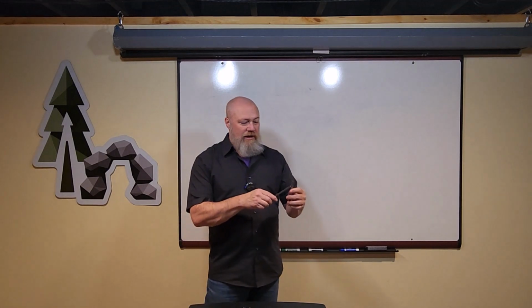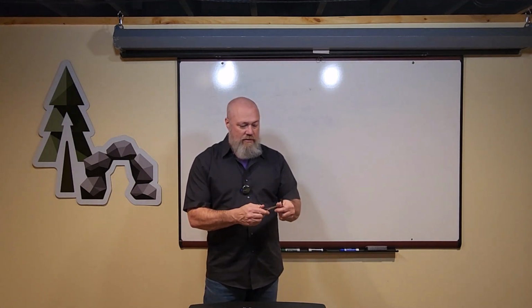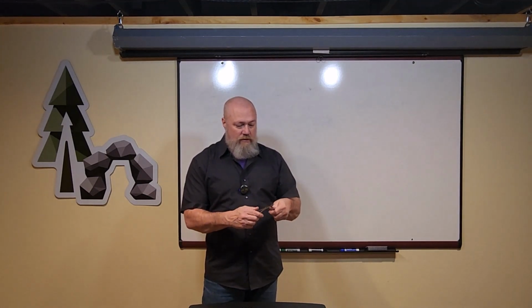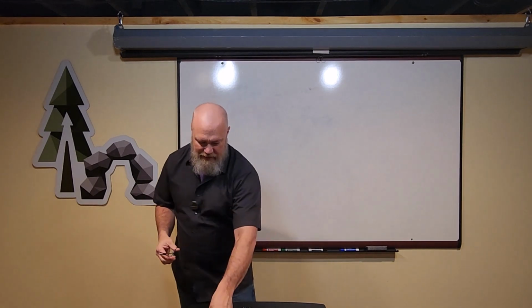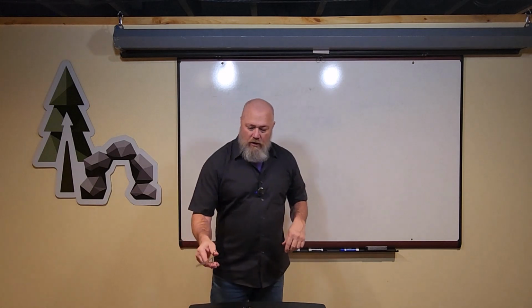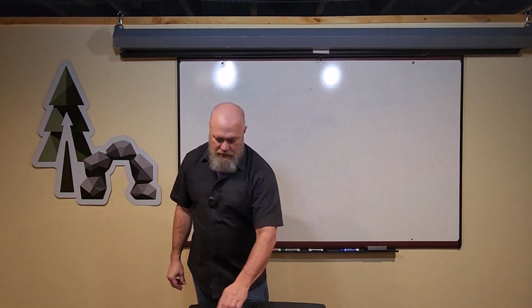Let's see if we can hear that. There we go. Okay, and then I have my scalpel handle. Remove the blade the same way. I'll lift that little tab up. All right, and then grip the blade and slide that off. Well, that's new and it's stuck on there, so we'll come back to that demo later. And then all scalpel blades come off, go into the sharps container, and then you'll get a new blade.